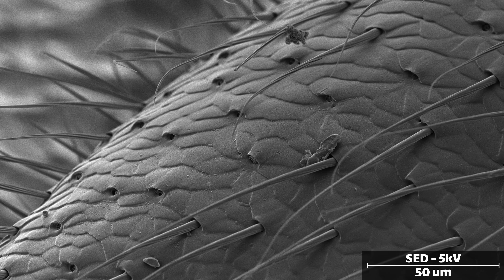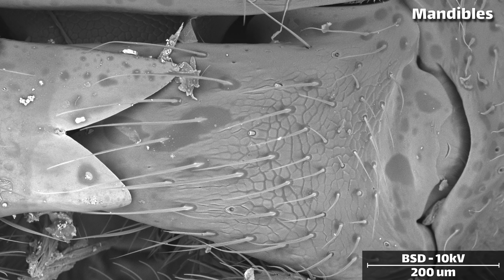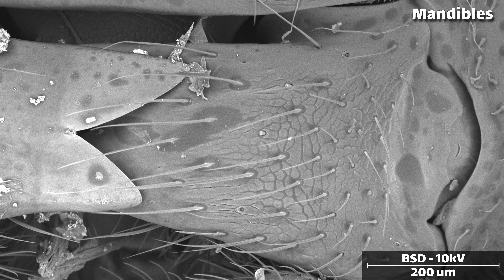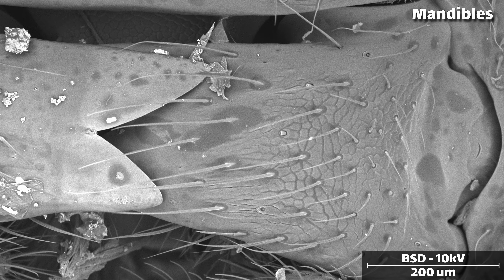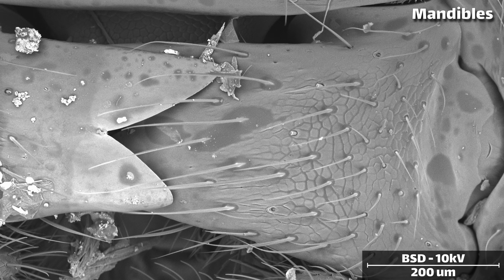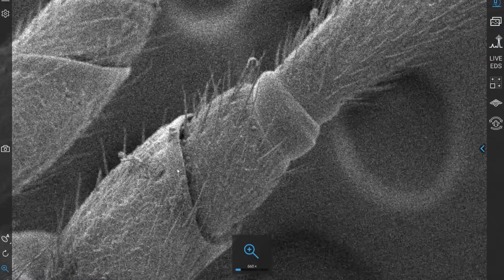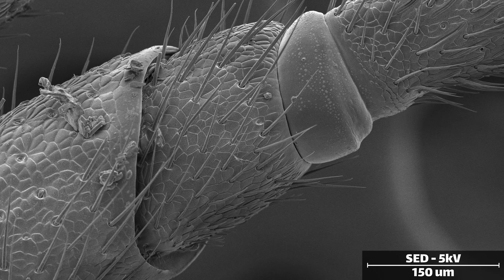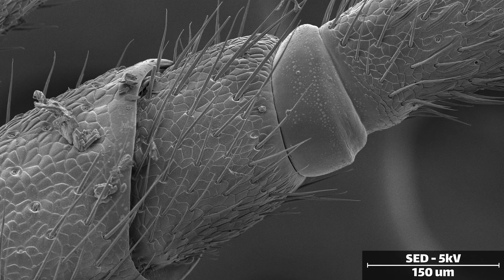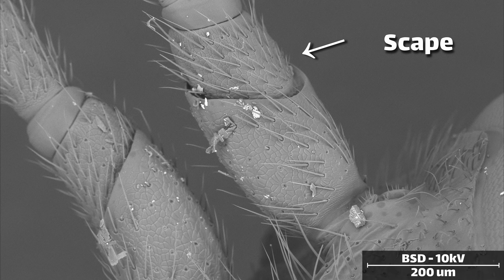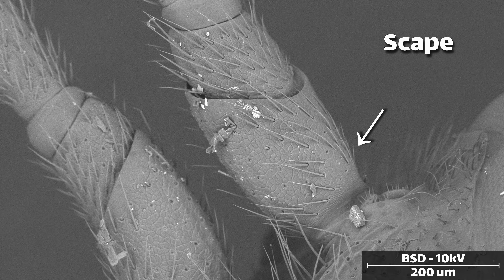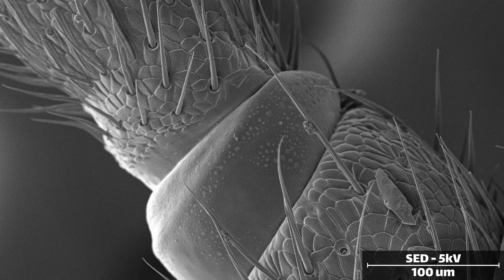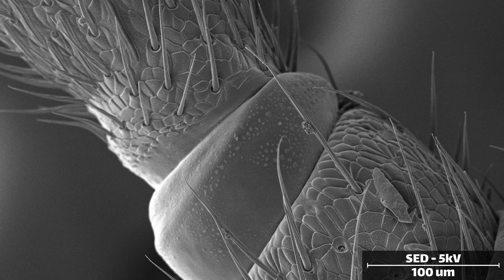There are a few interesting landmarks on the wasp that I wanted to call out specifically. I found the antenna section just incredibly fascinating. The antennae are composed of three main sections: at the base is a segment called the scape, which attaches to the head via a socket allowing the antenna free range of motion. The next section is called the pedicle.